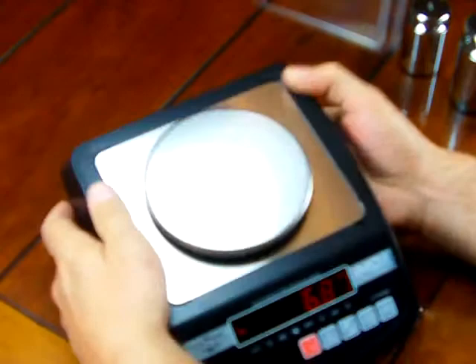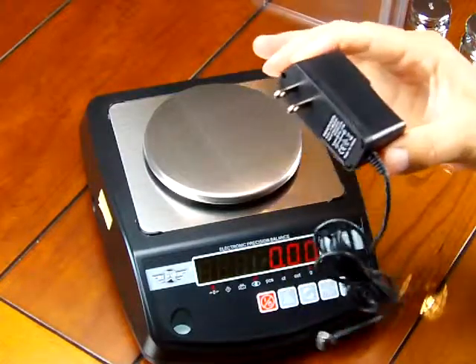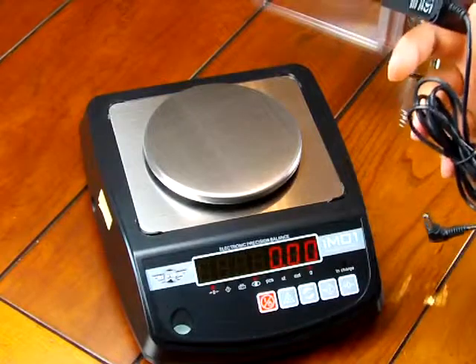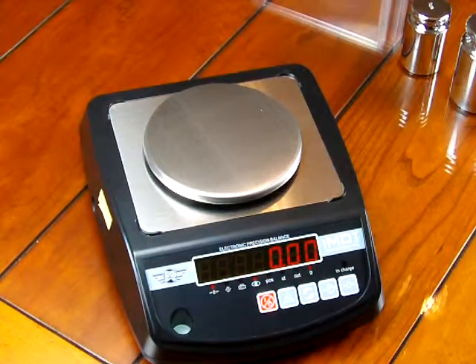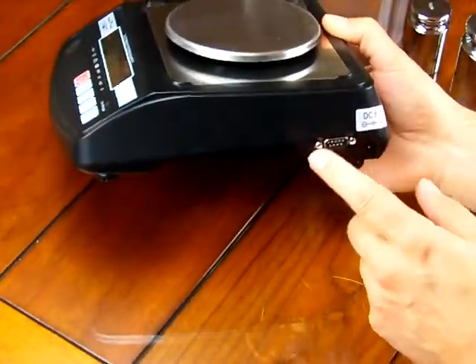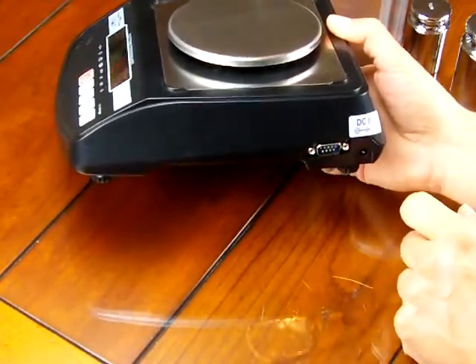Another feature: the scale comes with an AC adapter when delivered, so the AC adapter is not an option. Many manufacturers now make everything an option — from AC adapters to batteries, you name it. This scale also has that RS-232 interface on the side that I spoke about. We don't support it, but if you're good with RS-232, there's an RS-232 port on it. The AC adapter gets plugged in right on the side.